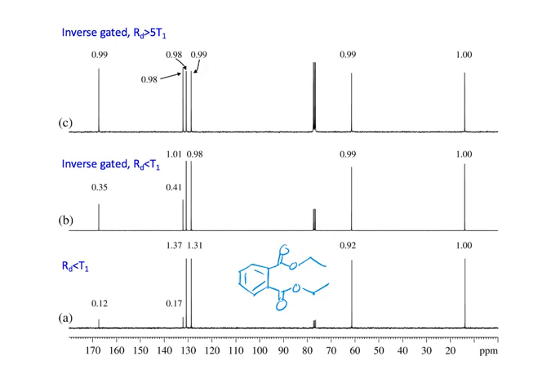And then I took it into my boss to show him. I was all proud. I had been working so hard, and he's like, oh, yeah, that's some phthalates like this. The C13 isn't so characteristic, but the proton NMR has a pretty characteristic spectrum. So it was a kind of contamination, you're saying? Yeah. So it was a learning experience, and from then on, whenever I saw that in a sample, I immediately knew what it was.